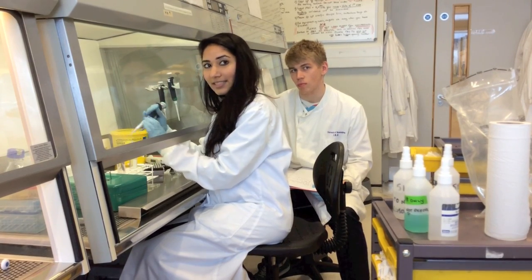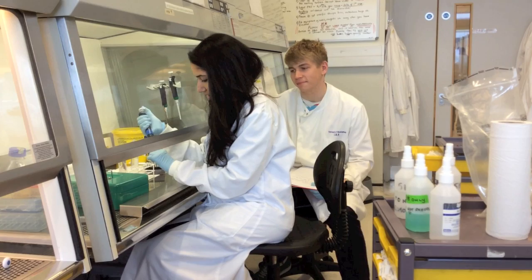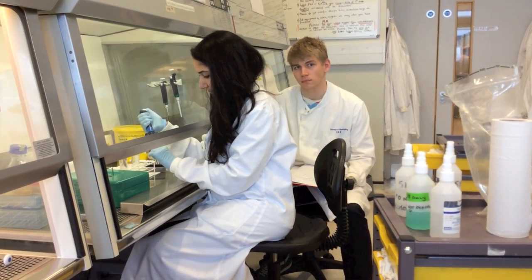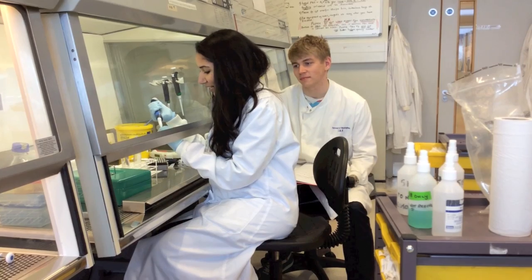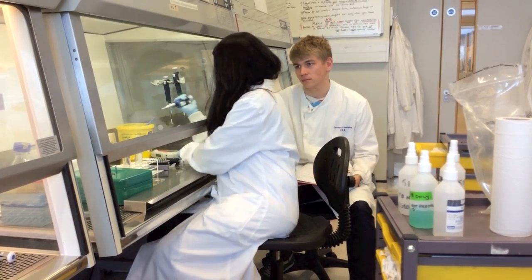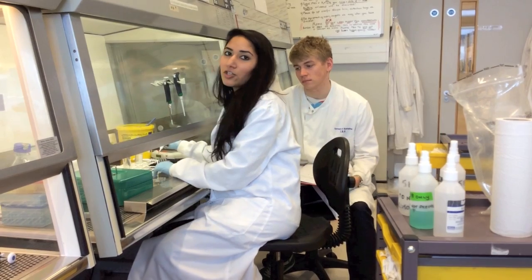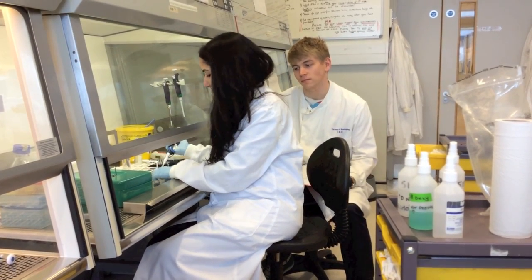That's quite rare, isn't it? Yeah, it's normal livers in the laboratory. So what's your experiment today? Well, now that I've extracted the cells, I'm going to stain them for different B cell subsets. And this will be our control liver to compare to other disease livers that we've received in the past.